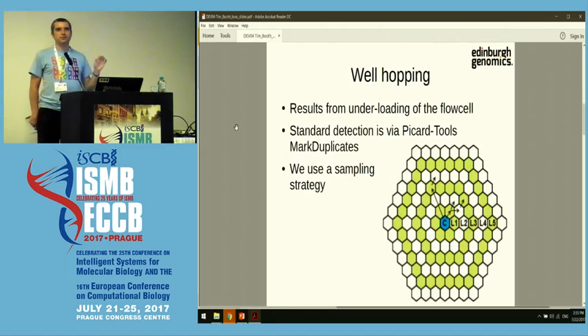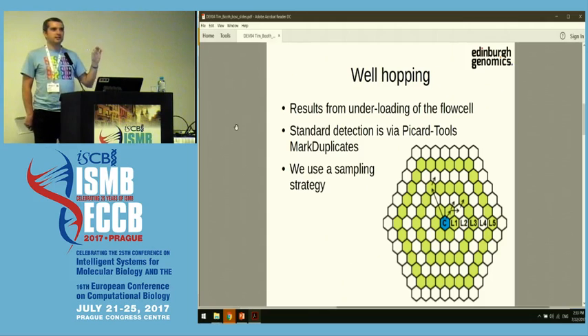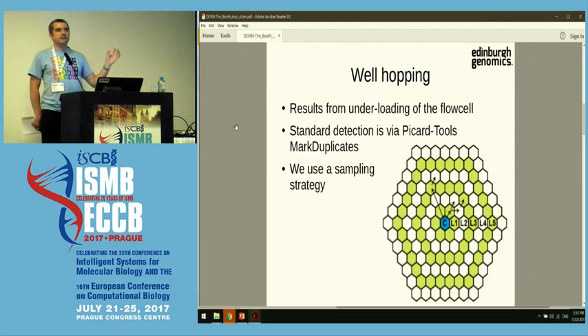Obviously, this is biology, so nothing's ever quite that simple. There are various problems and glitches and quality control things you have to take into account. One specific issue that this talk addresses is this idea of well hopping. Your sequence that's in the blue well in the center there is not staying put — it's ending up leaking out into the surrounding cells. So you're actually reading the same sequence multiple times. It's a true technical duplicate. You want to avoid these if possible and at least quantify them, because not only are you wasting sequencing space, but if you're trying to do something like RNA-seq, this is going to upset your quantification numbers.